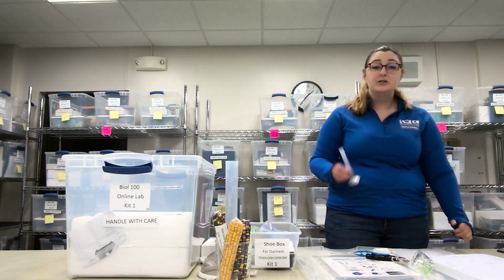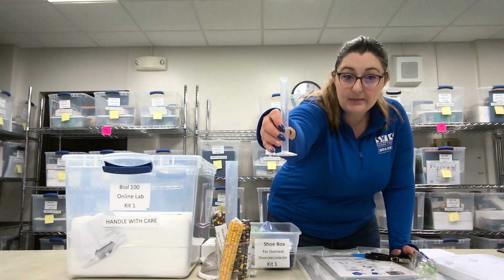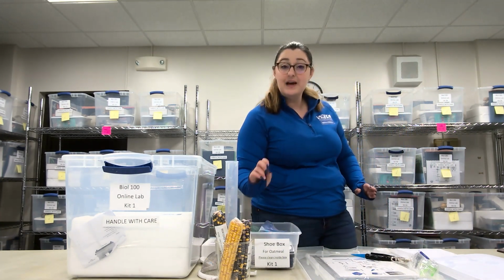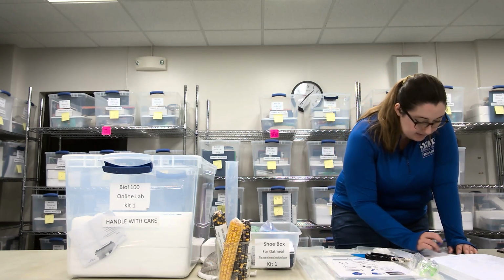And then we will move on to the 10 mil graduated cylinder. That is this guy, itty bitty tiny. Go ahead, put that into the kit and come back to the list. We will check it off.